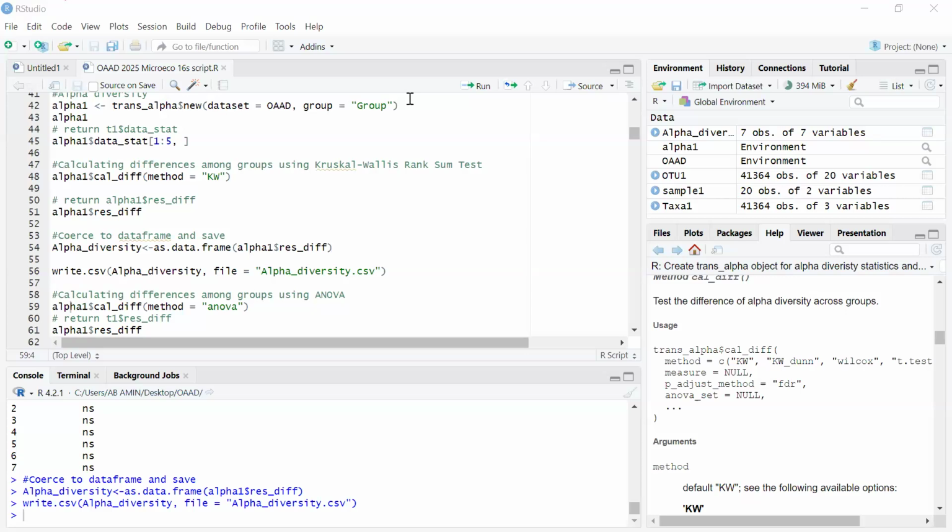Yes, please. Are you following with your computer set? Yeah, I'm trying to change my working direction. I have all the data set downloaded. I just want to change my directory. So please, I'll just be using you as the listener. From the participant, I hope everyone now has his data sets ready? And I think Dr. Kakari can also help Benjamin.